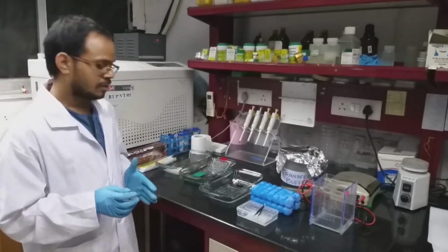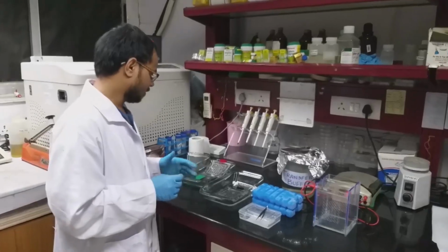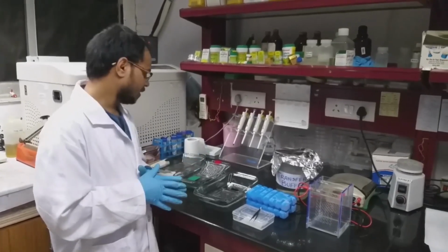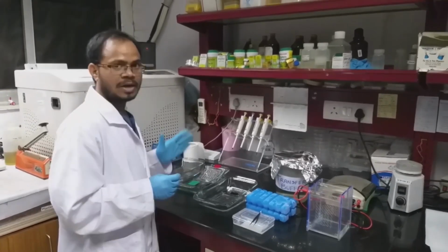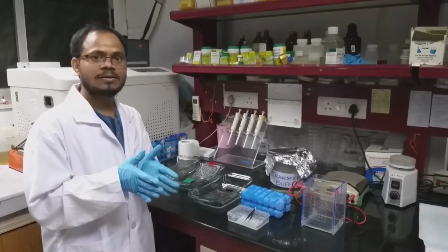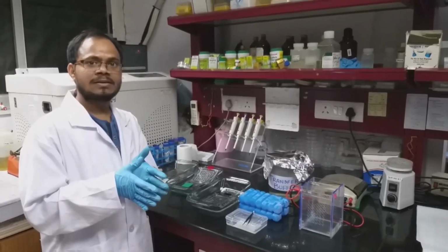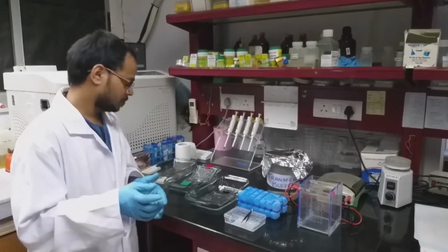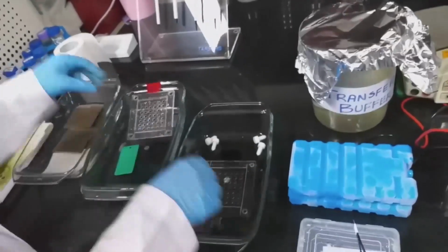So we need a pre-run gel. We have already finished the gel running. In addition to that, we also need sponges which will give cushion to the gel, so that the gel is not destroyed during the transfer.